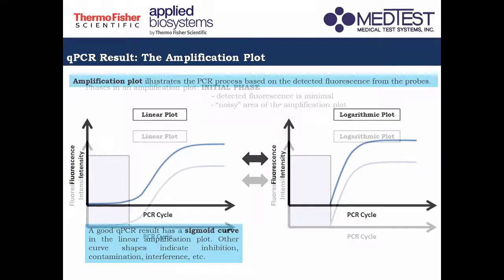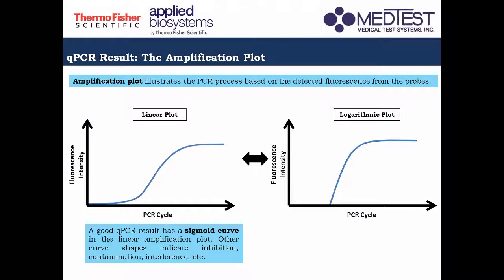Now, how to read your qPCR result? No? So, after we've done the PCR process, what now? So, basically, di ba, ang real time po natin, what we're after is the monitored PCR run. So, ano po ba yung representation ng PCR run na ibibigay ng instrument natin?